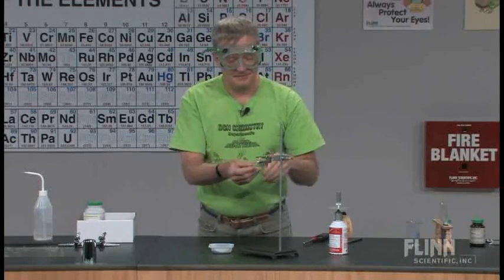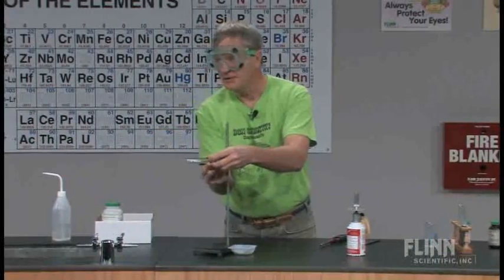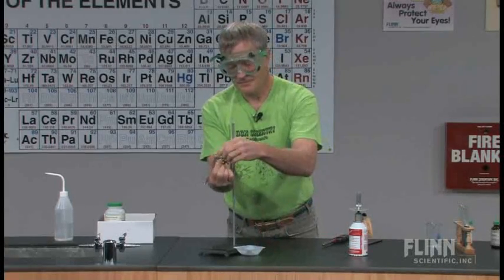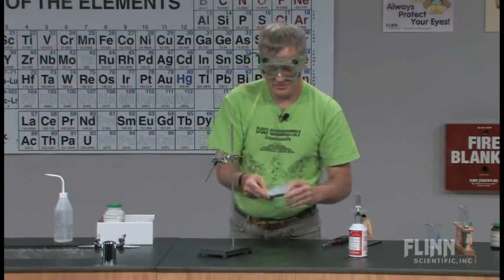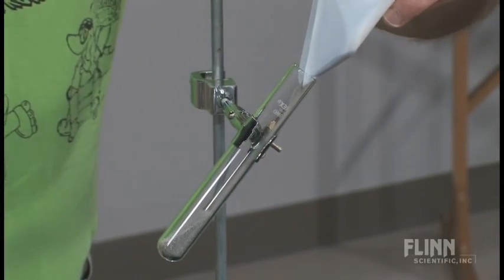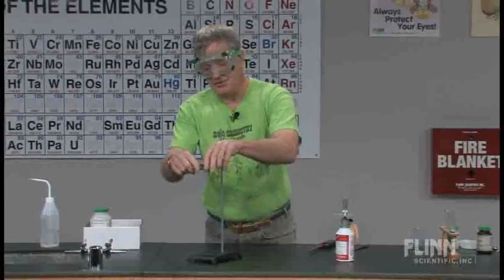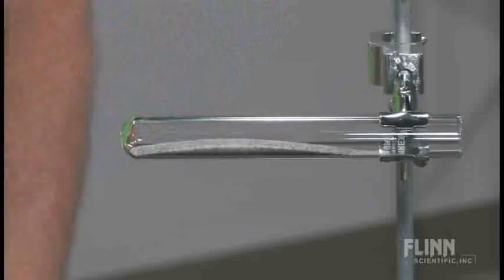So I'm going to slide that in. Let's see. I want to line this up so that the back is best for the camera here. That pretty good for you guys right there? Okay. I'll bring it back up to that position after I dump the solid in it. Okay, so let me get this thing in here. And the amount is not all that critical. Get some in. When you get it in there, you want to shake it out so that it's flat, so you've got a lot more surface area on top. So that should do the trick.